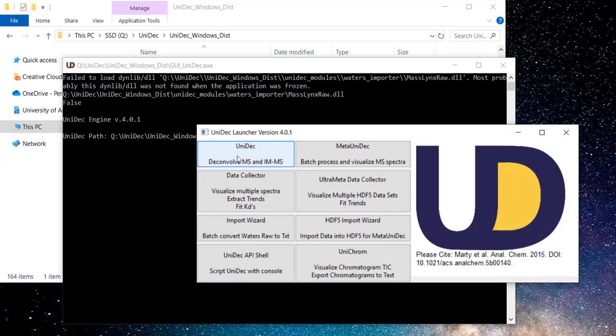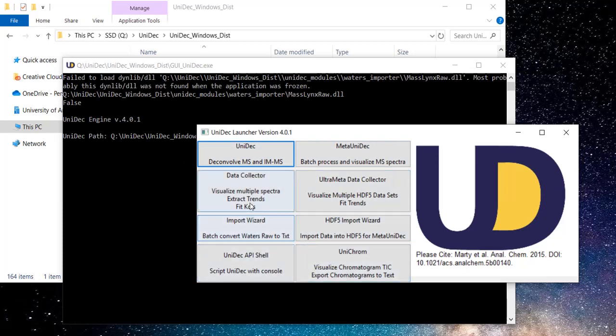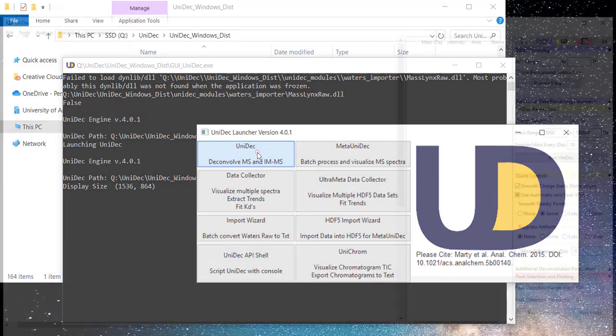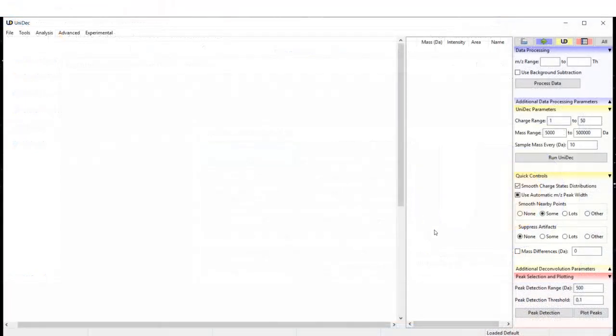As you can see, there are a variety of options, but for now we will focus on the basics. You should now see a window that looks like this. The next step is to import some data.